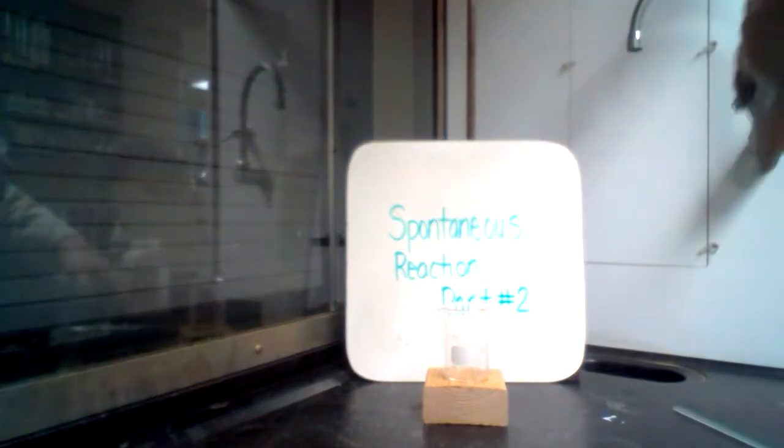So barium hydroxide is first. I'll take a spatula and spoon in approximately 30 grams. That's about 30 grams.